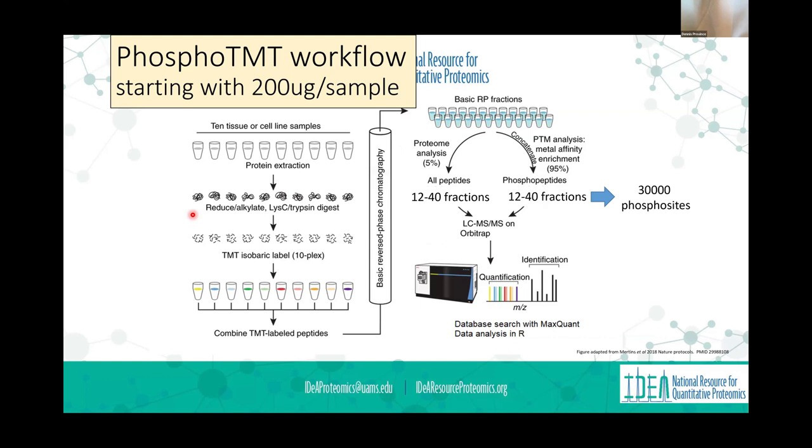And TMT does a really good job for phosphoanalysis. One of the advantages that it has is this TMT reagent holds on to protons really well. And so it will help phosphopeptides that are a little difficult to ionize because they have negative charge on them. It gives another spot to put a proton on the peptide and make it ionized a little bit better. It also helps the fragmentation a little bit better. And so it really is a pretty good method for quantifying phosphosites.